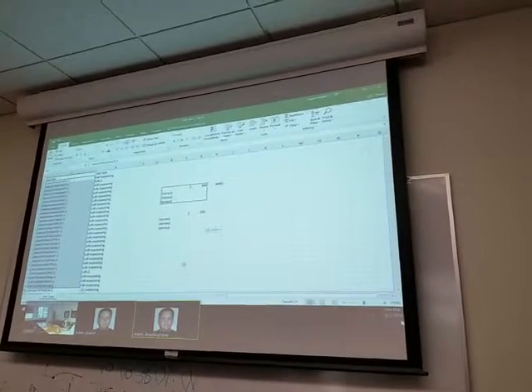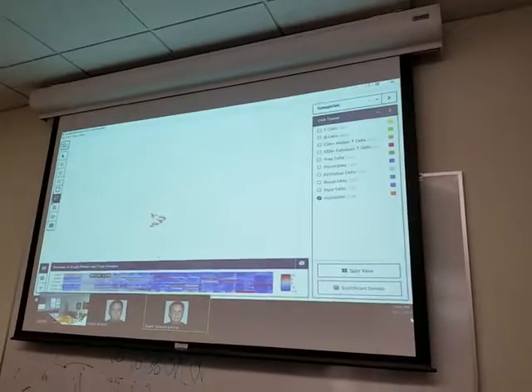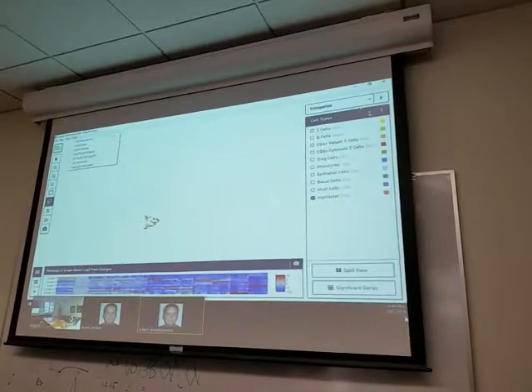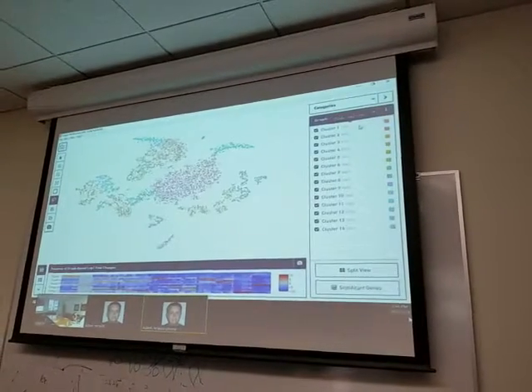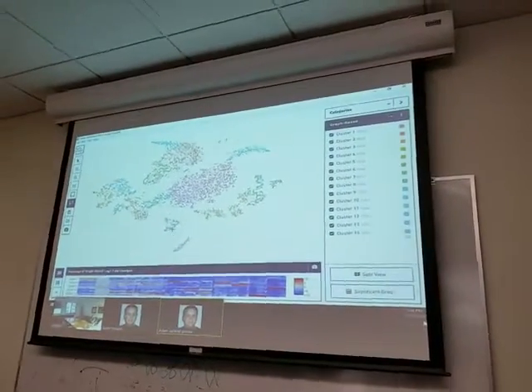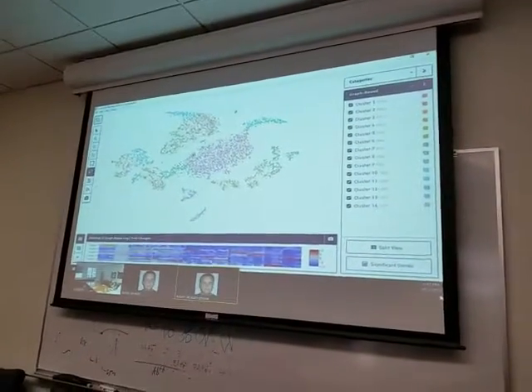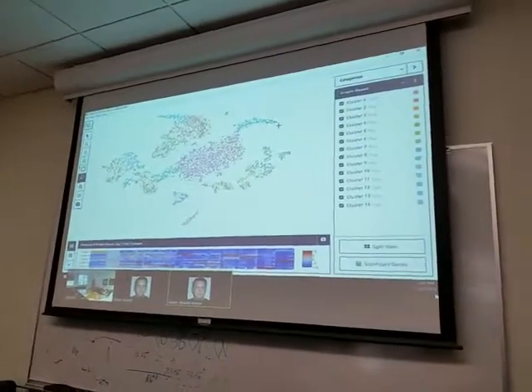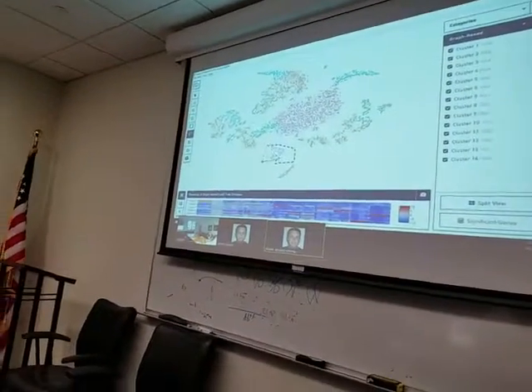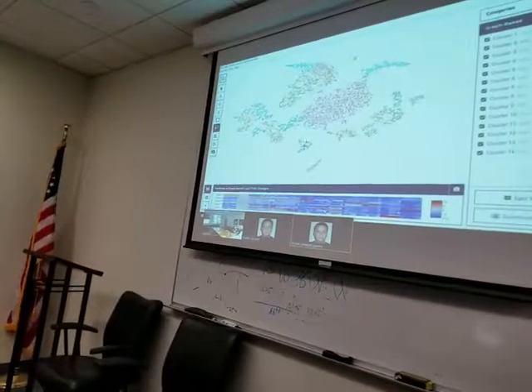To be honest, I don't know why you would do that necessarily. Just to zero in, even subdivide the little subdivided one there. Yeah, but at that point, probably it's just going to get noisy, right? Because this clustering that's forming is because we've given it a diverse data set with thousands of cells in it. If we repeat the analysis literally just on this one, what it's going to try to do is cluster this.